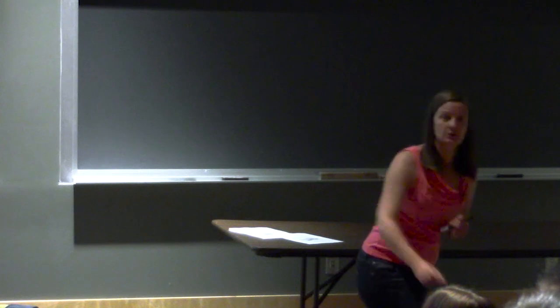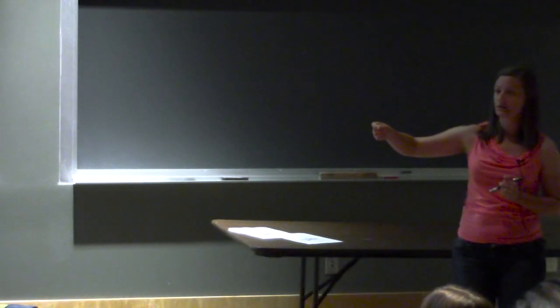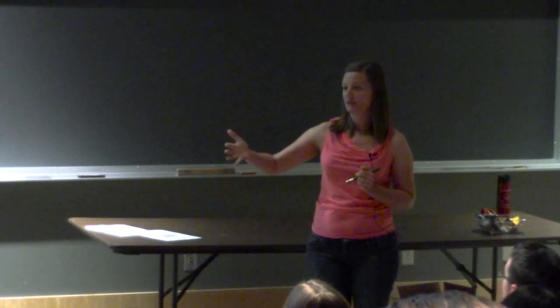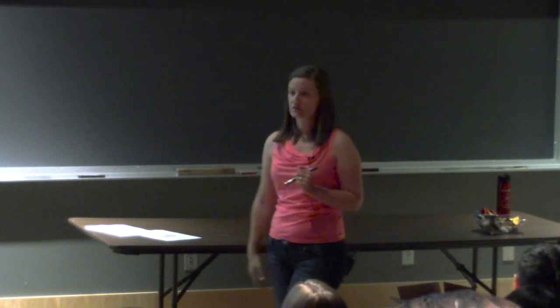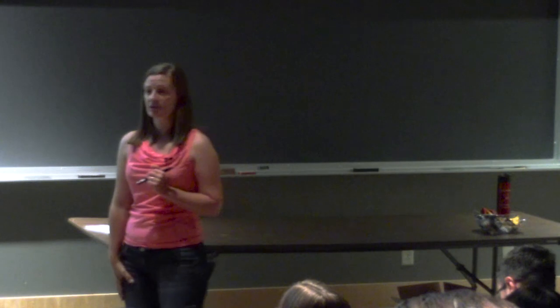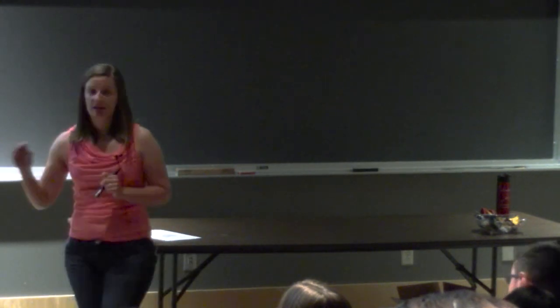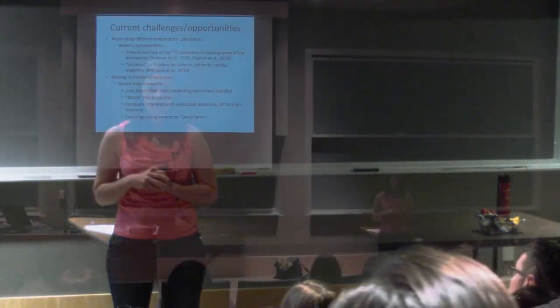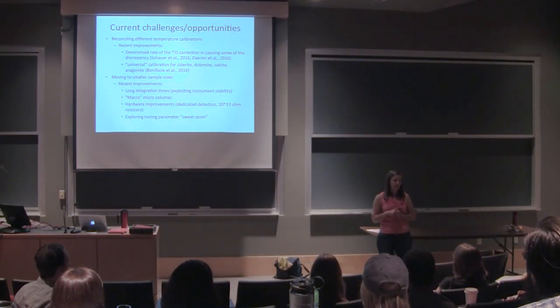But essentially what you're doing is you're taking the precision, which gets you part of the way there, the good analytical precision we can get on modern instruments now, and then you're getting the rest of it that we need for, say, plus or minus 2 or 3 degrees C precision. We're getting the rest of that by simply improving our counting statistics, so measuring that same aliquot of gas over and over and over to get a good measurement.